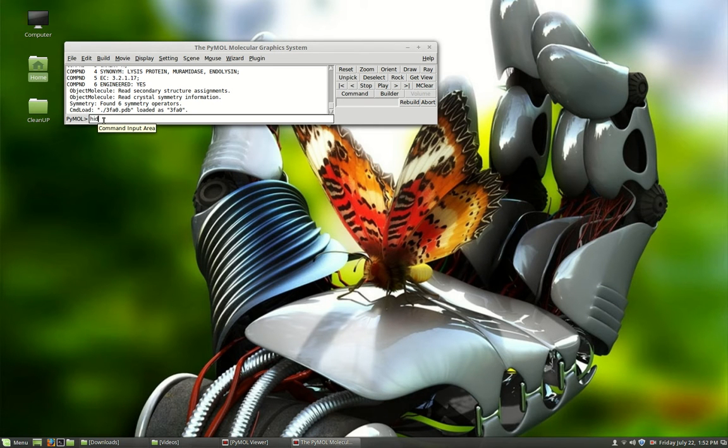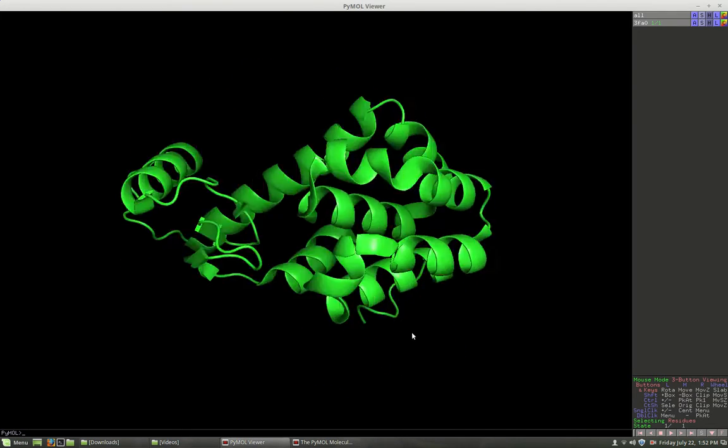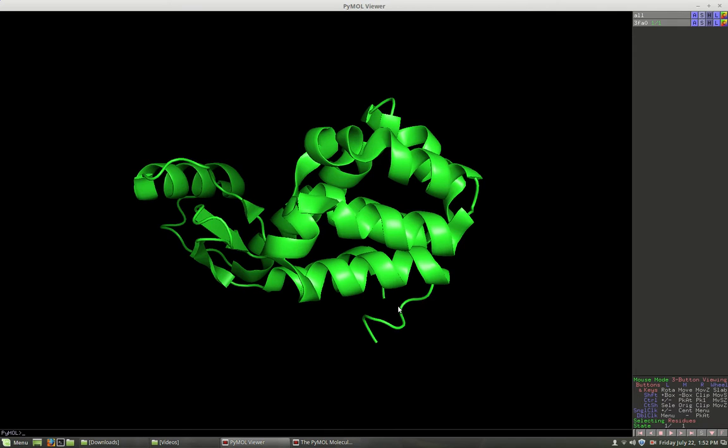So I'm going to go hide everything. And then I'm going to go show cartoon. Enter. Now let's see what that did to our viewer. And this, of course, is what we're used to with our cartoon model.